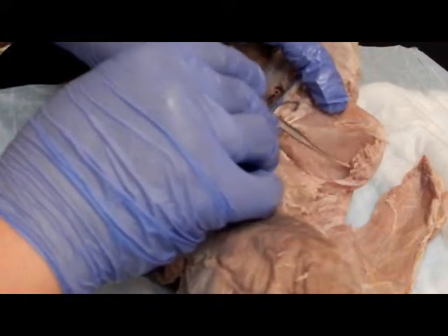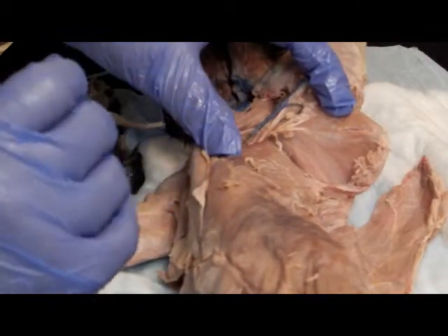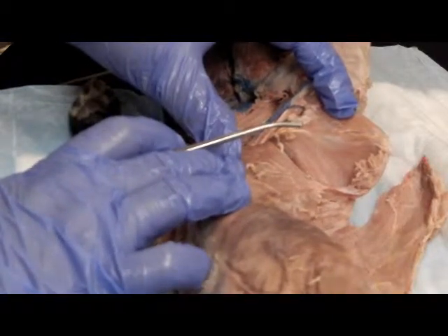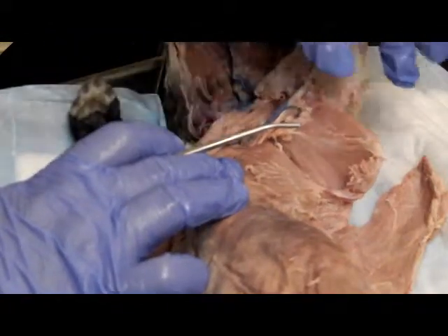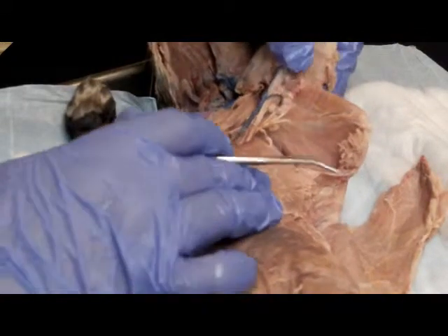This is the subscapularis. Its origin is the subscapular fossa of the scapula. Its insertion is the lesser tubercle of the humerus. Its function is the chief medial rotator of the humerus, assisted by pectoralis major, helps hold the head of the humerus in the glenoid cavity, stabilizing the shoulder joint.